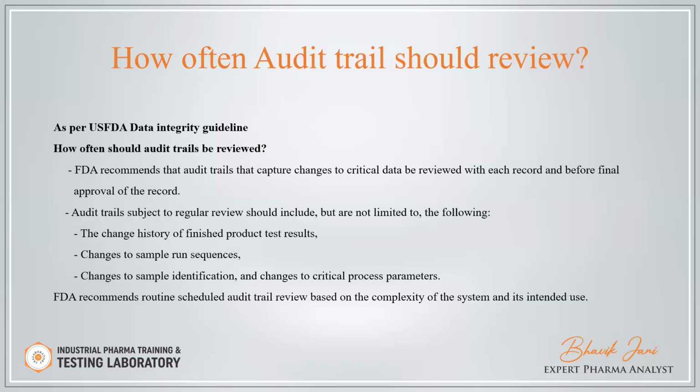How often should the audit trail be reviewed? As per the US FDA data integrity guideline, the FDA recommended that the audit trail that captures changes to critical data be reviewed with each record and before final approval of the record. Means before release of the batch, the data audit trail should be reviewed. Audit trail is subject to regular review. What should be reviewed before release of the batch?